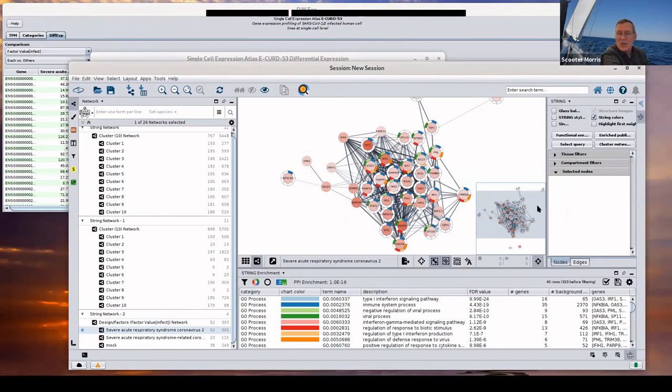Generally, too many colors, there's a whole visualization analysis that says if you get too many colors, you can no longer distinguish between them. So 8 is a very safe number. You can do 10. If you get to 20, you're just going to lose all sense of what's really going on.